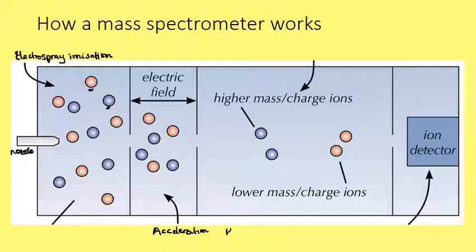And you might remember that from physics, that kinetic energy equals half mv squared. And in chemistry, you don't need to know that formula for kinetic energy. Suffice to say for chemistry that if m is bigger, then v is going to be smaller.